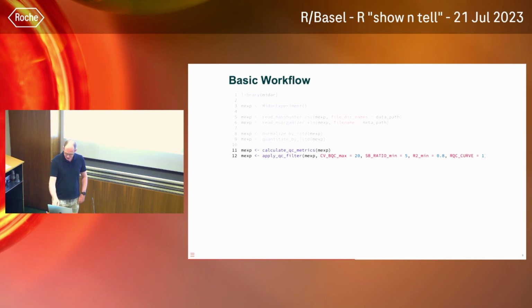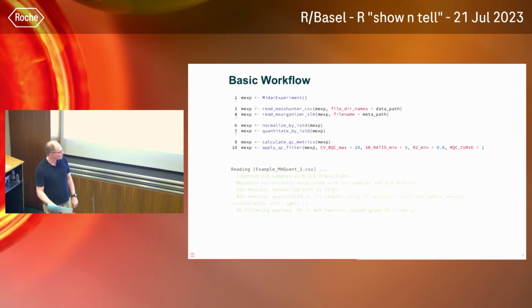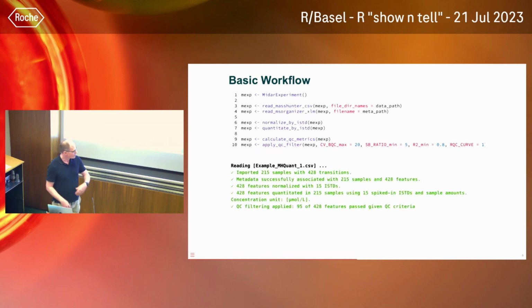So typical analytical chemistry parameters. And the idea is really that the names are clear and well defined, so people can go through and also copy-paste such chunks. But then also that they get feedback, so that they really know what's going on. Often some of these other packages I described will give no answer, so you have to go back to the data and check.